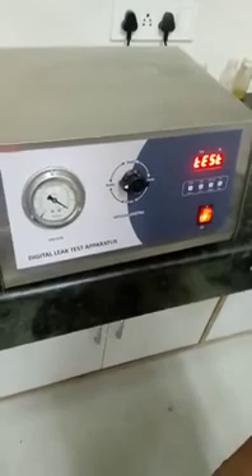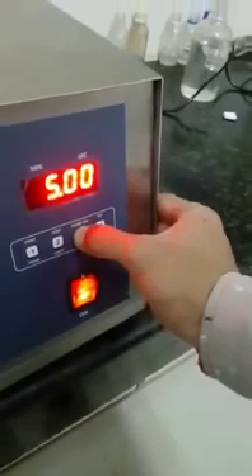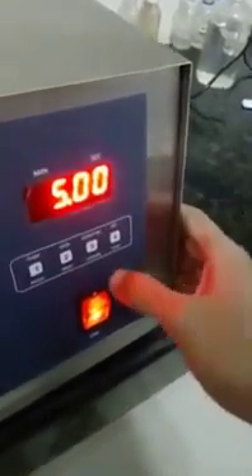Then we have to go for switching on the machine. It will take around one and a half minutes just to start up. Then we have to set a time — up to how long you want to run the process. We have to set it by pressing the set button. Right now we have set it for 30 minutes. You can change it by using the shift key, changing seconds to minutes. Now we have to go for the 5 minutes option — we have selected 5.